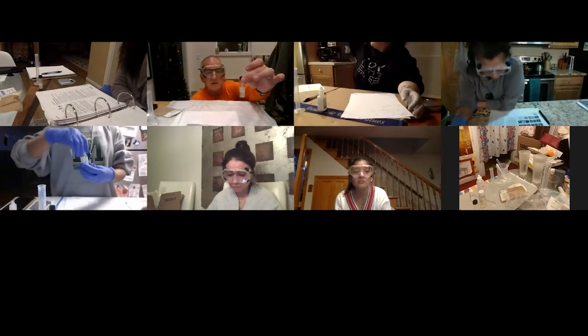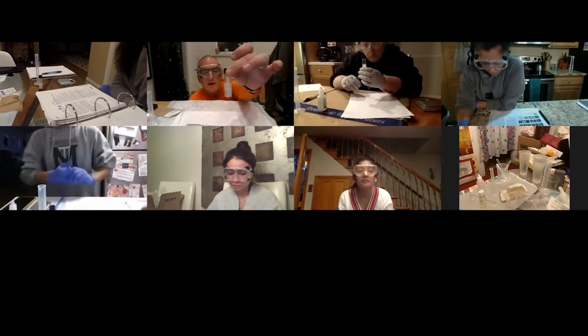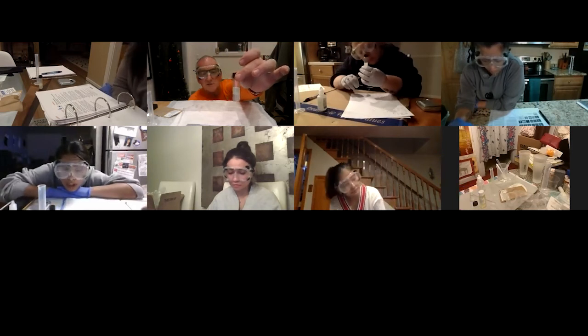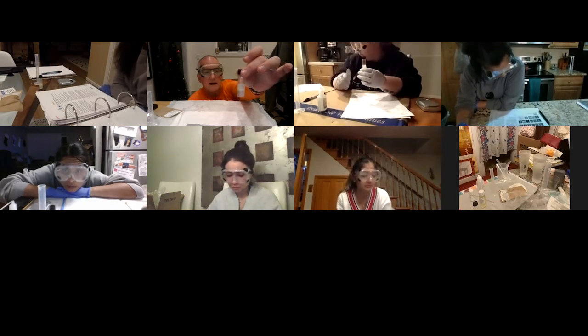I suspect what we want to look for is eventually, if we just keep shaking this long enough, the whole thing will look like the top layer. And that will give us the maximum interaction of the oil with the hydroxide.